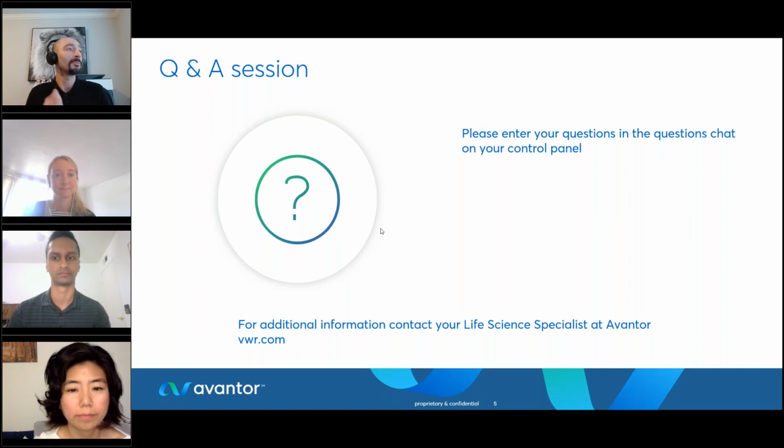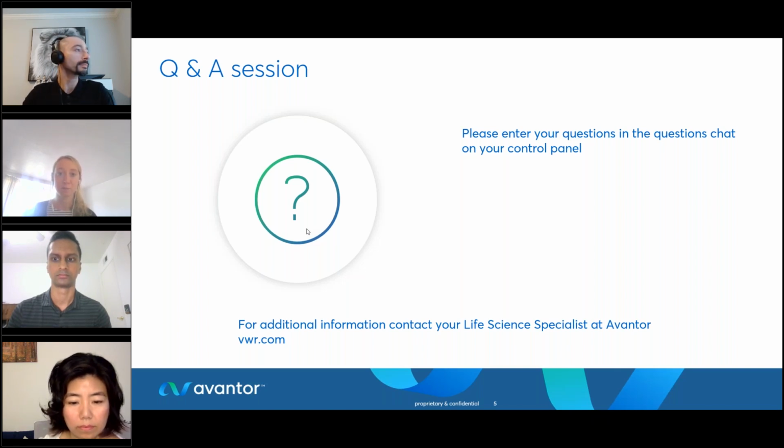Great, thank you. Moving back to you, Sarah. How does the bioinformatic analysis distinguish sequences from different plasmids downstream or within the assembly step? So unfortunately, at the moment, the workflow isn't set up to detect different contaminants. What probably would happen is you would get an inconsistent assembly. And unfortunately, it's not at the moment set up to manage multiple plasmids in one sample.